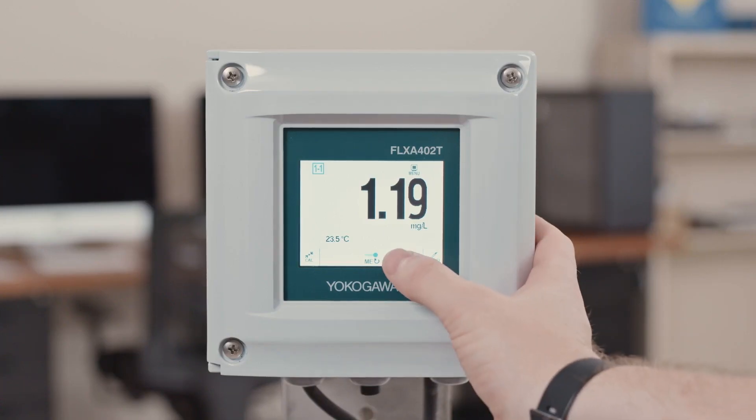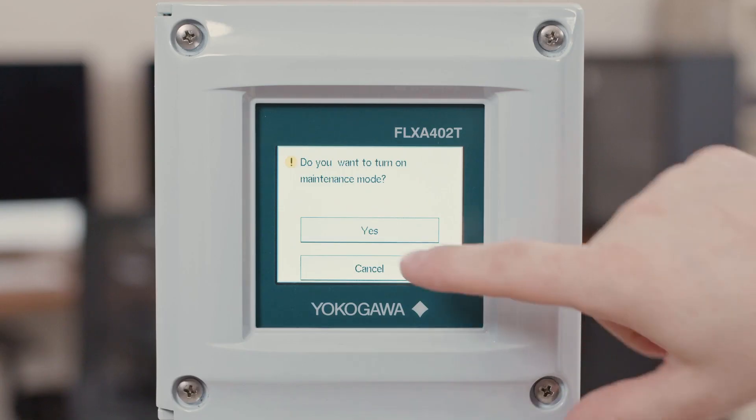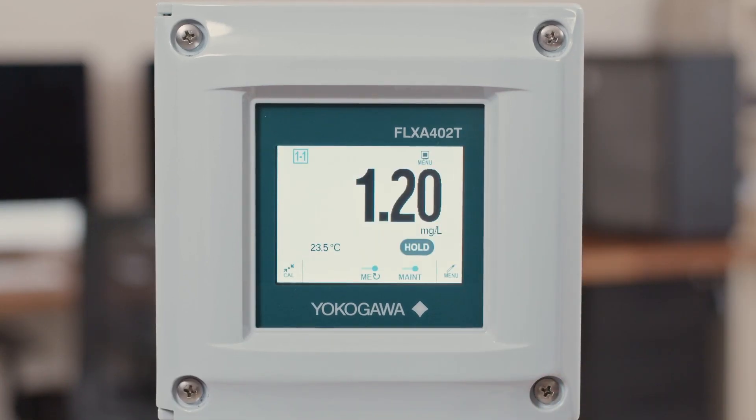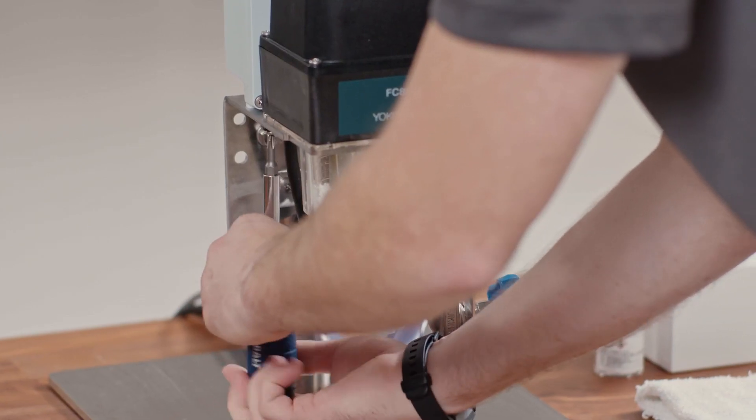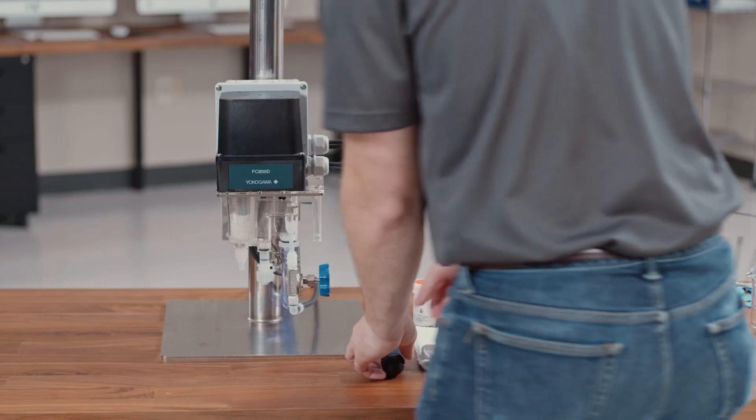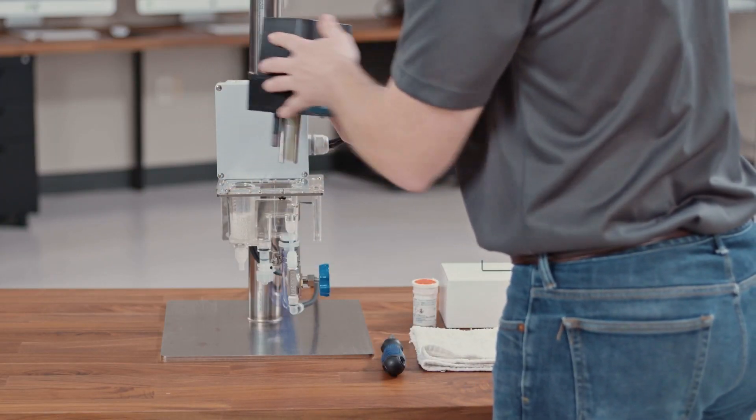The first thing you want to do is turn the analyzer into maintenance mode or remove power from the analyzer. Undo the two screws at the bottom of the flow cell and put the analyzer assembly into maintenance position.